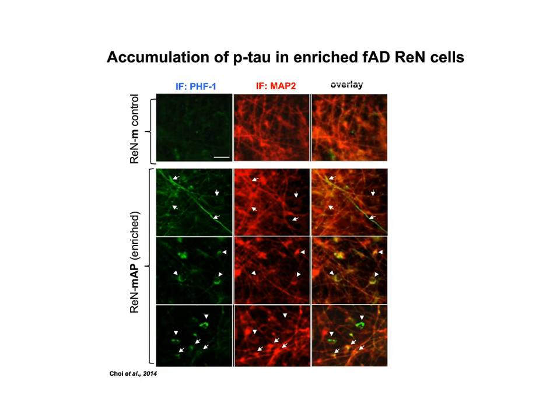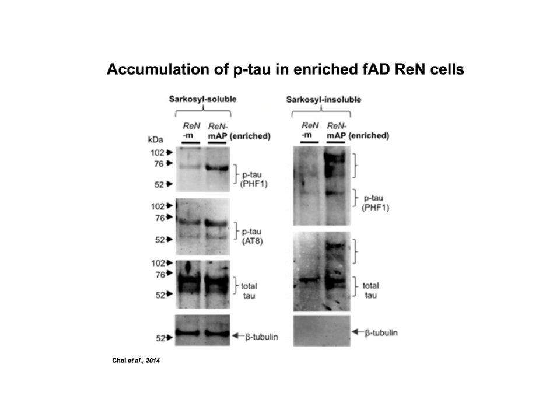And we see it in the neurites, especially the dendritic compartment, and then you see it in the cell bodies. And we even see cell bodies with a spotlight structure. We think it's a form of pretangles, but we need more experiments to confirm it. And biochemistry shows a robust increase of the phospho-tau and total tau in the insoluble fractions in these AD cells.